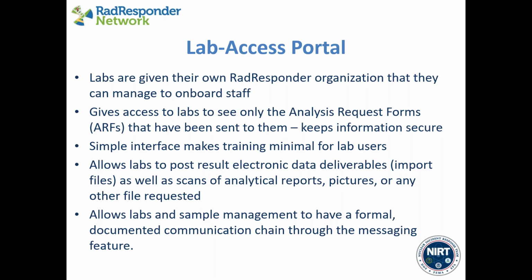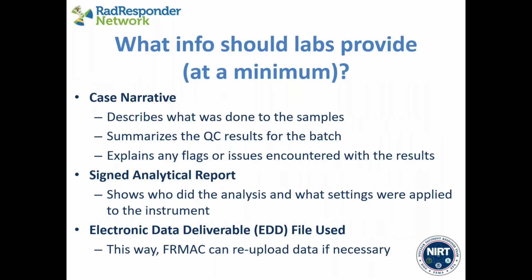So the lab can go in, pull up their analysis request, download the result template, fill it in and post that file, and also manage some communications between the people sending them the samples using this new messaging feature that we'll show you. We get a lot of questions when we do drills, exercises, and round robins with laboratories, where a lot of people ask what information labs should provide in a data package.